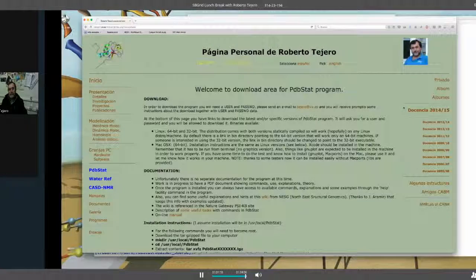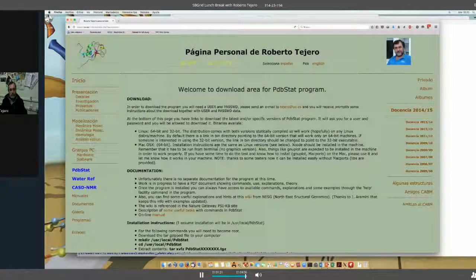Yeah, let me see. It shows the web page on the screen. You can see it's a description of some useful tasks. It's an online manual, but it's not well done.